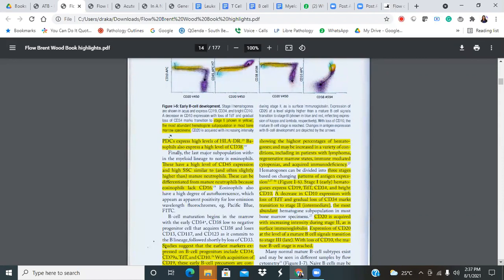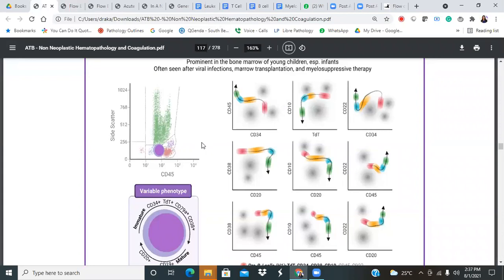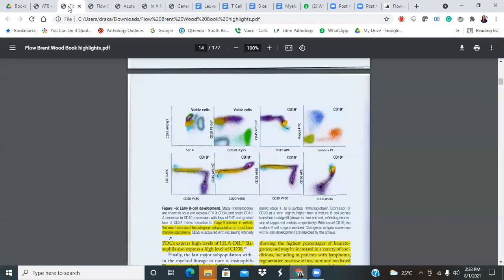And actually, if you see CD45 versus side scatter for hematogones, we will show it when we do our B-ALL sessions later. You will see that it starts from below, I mean, you will see them below the blast gate, and they will start from this end and go all the way to the lymphocytes and merge with them, like a small spectrum from the low end of CD45 to brighter CD45. It's a very continuous, distinct population sometimes. We'll show you that. You will see that it's starting from the blast and going into the lymphocytes, whereas B-ALL will be homogeneous and stuck at one place. Okay, thanks.